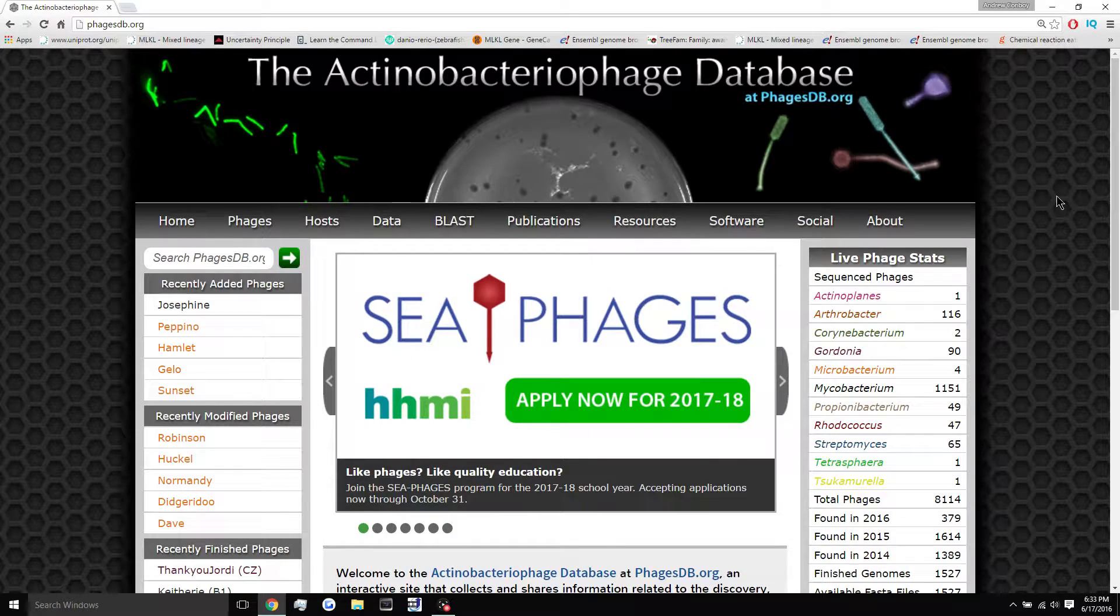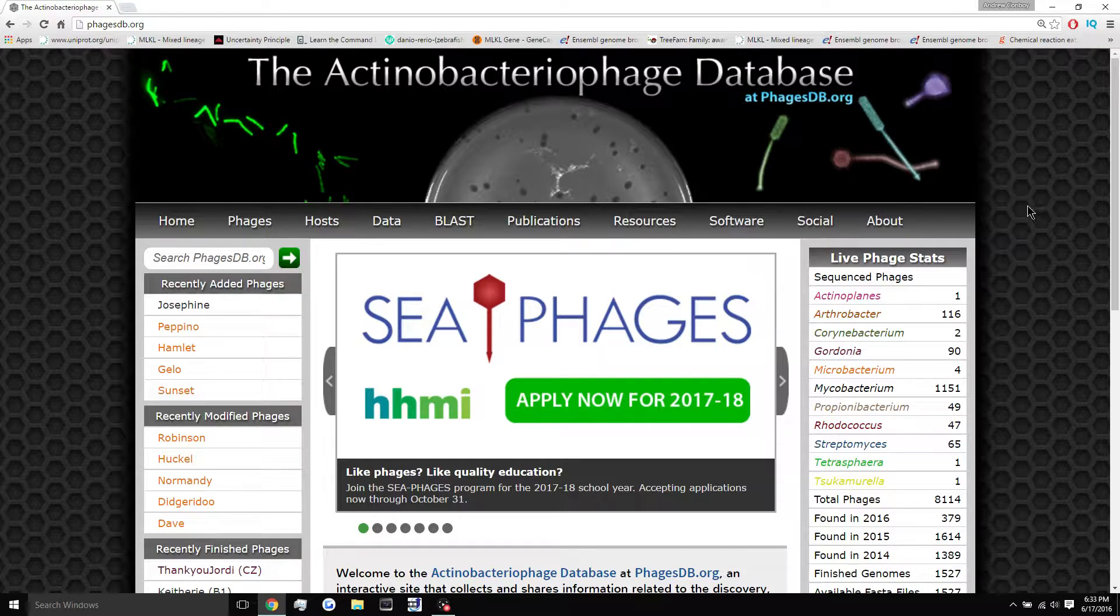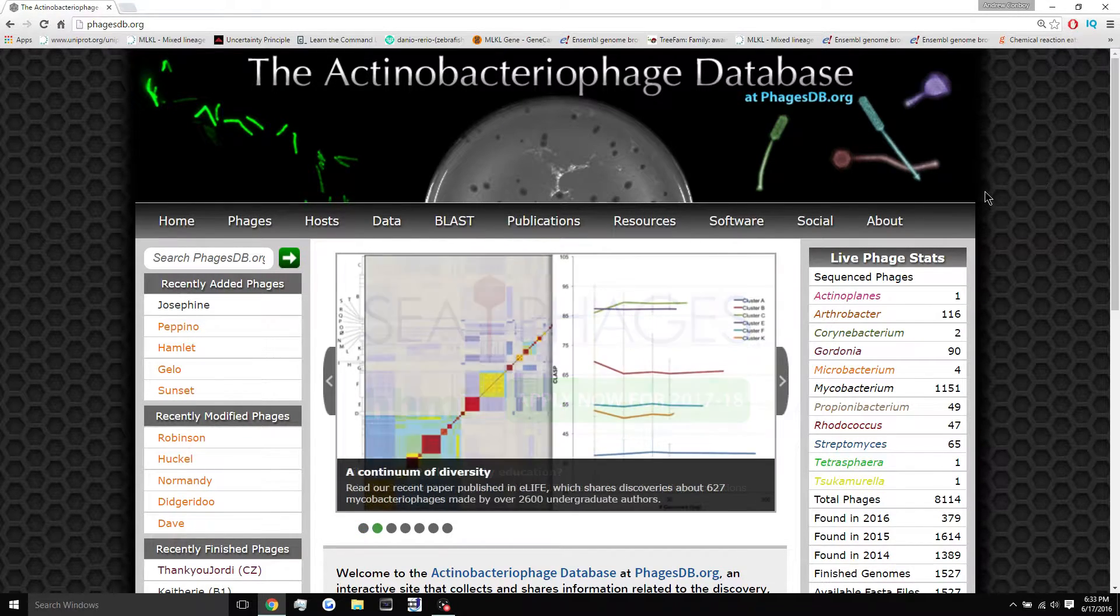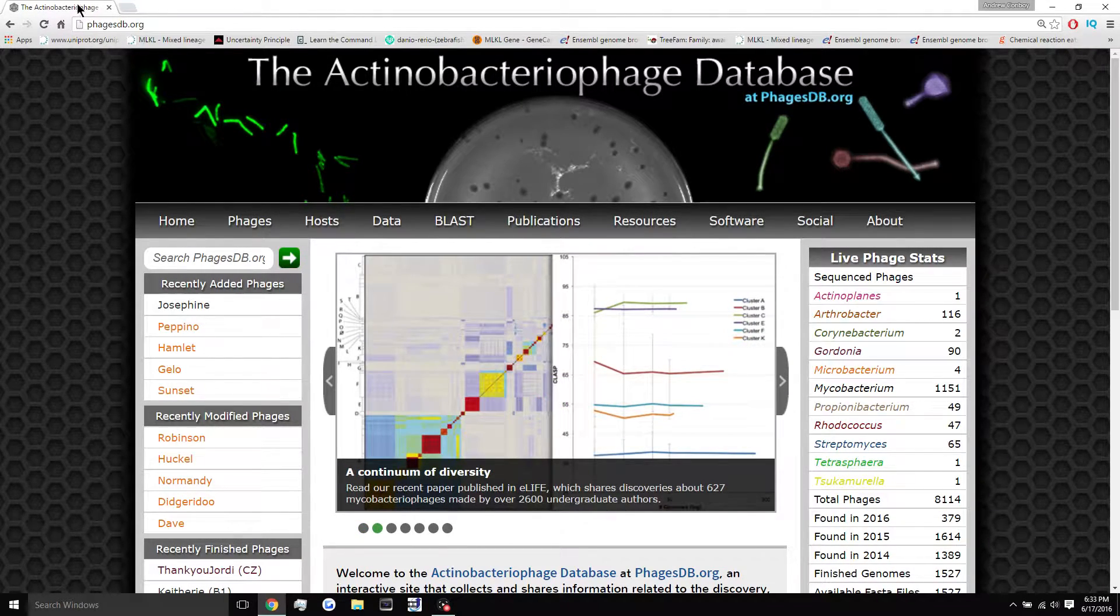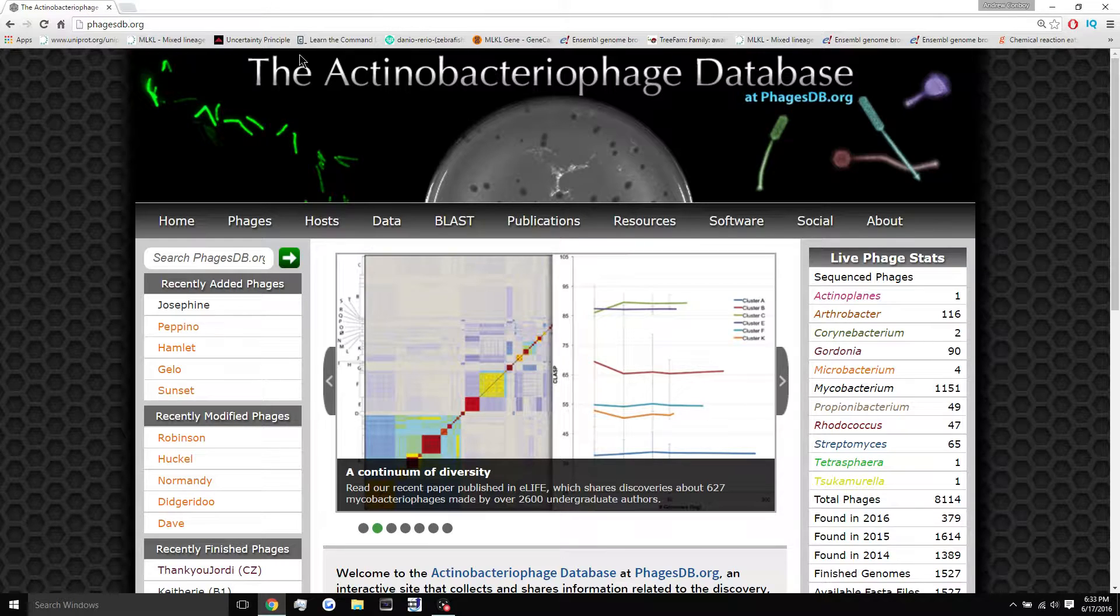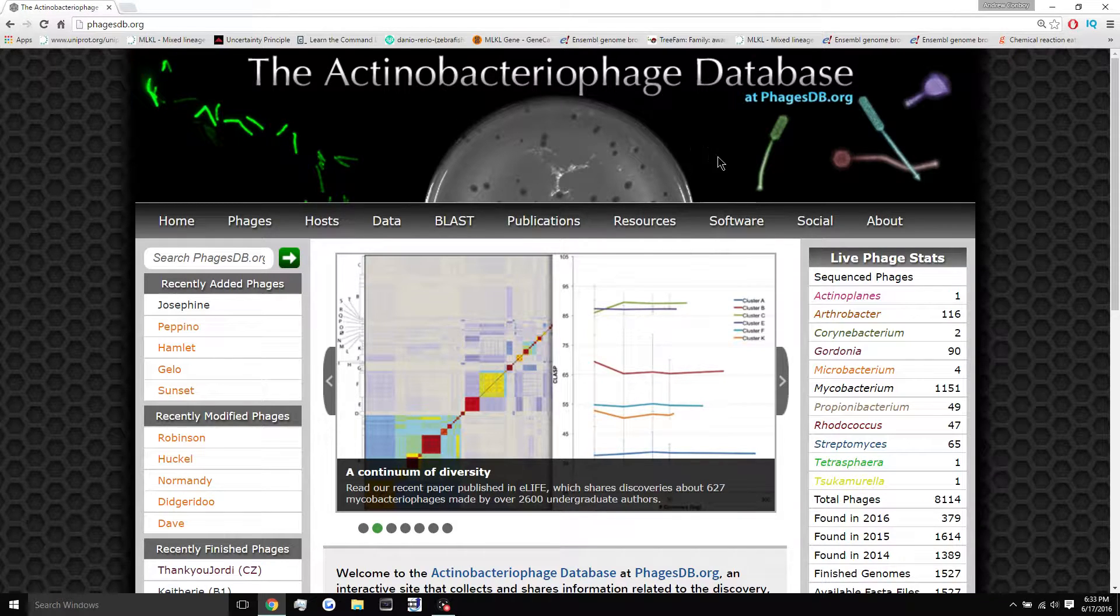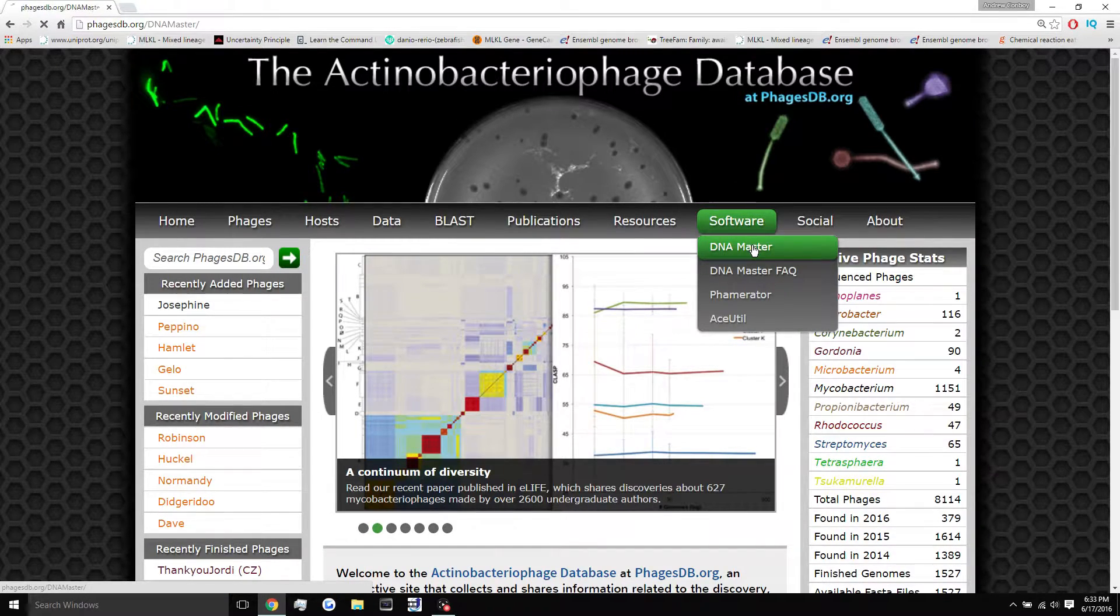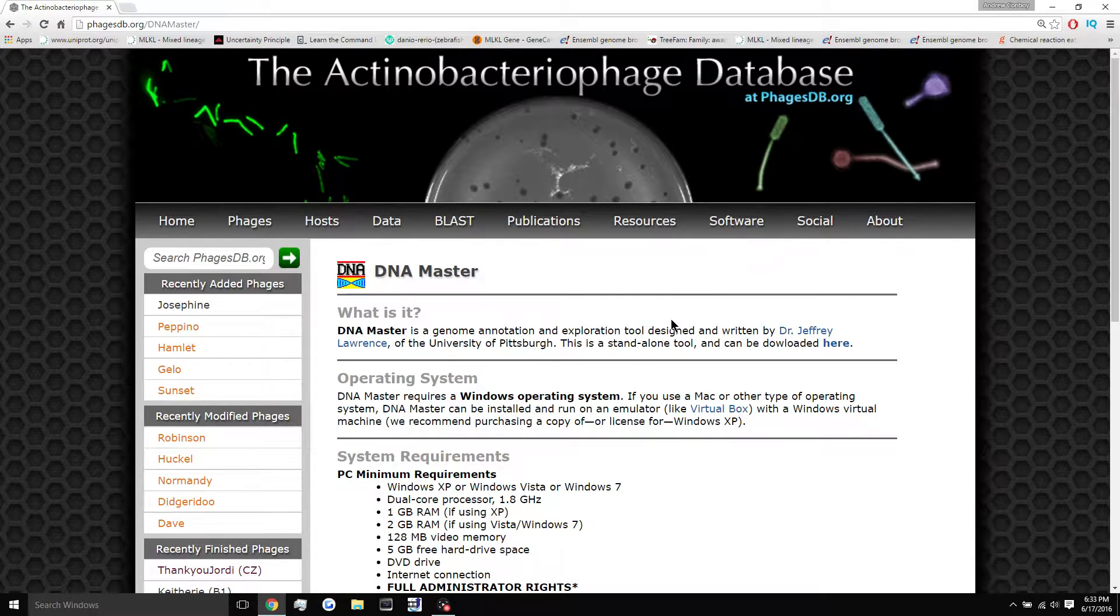And we do it through a program called DNA Master. So to get DNA Master on your computer, all you have to do is go to phagesdb.org, go over here to software, and click DNA Master.